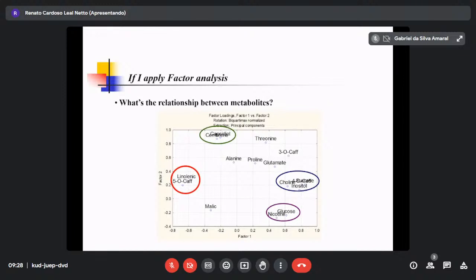Also, another reason is maybe these compounds can be synergistic. So metabolomic analysis data is not the end. It can always be a starting point for another research. Second, you might have a question: if we want to prove the activity, I have to isolate the compound, then why do I have to do metabolomic work with LCMS and collect this data?